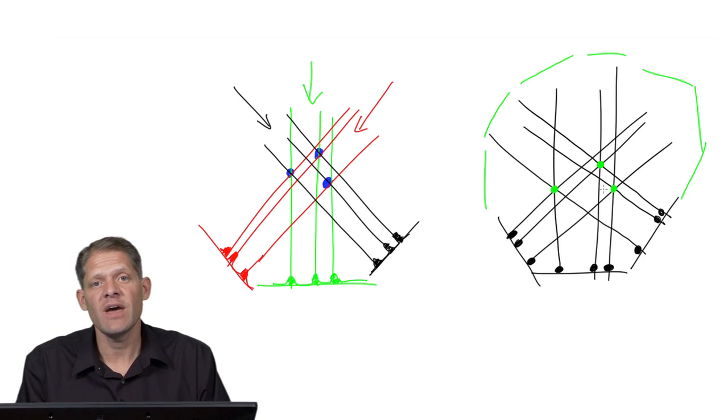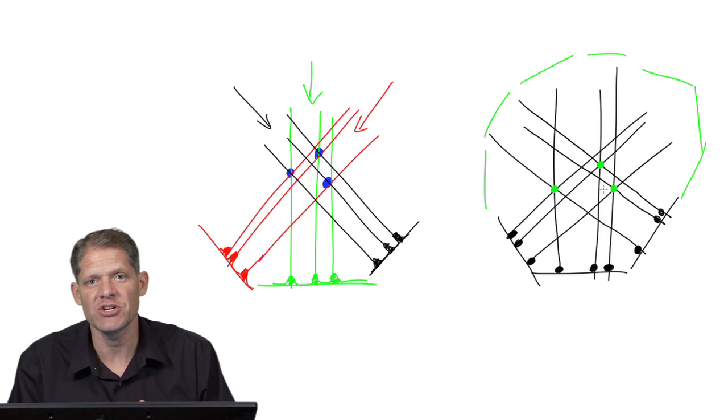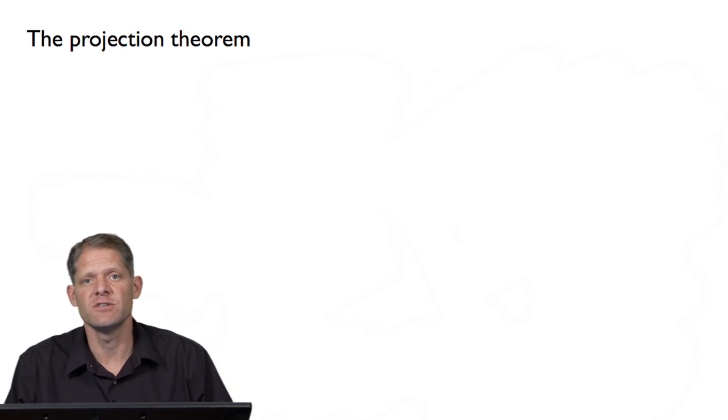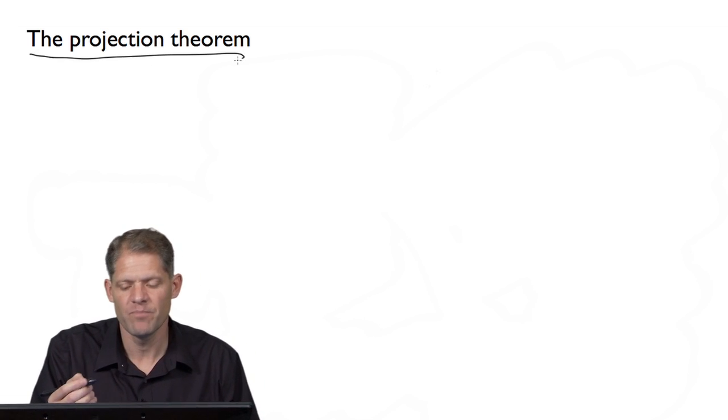So this is the basic idea of 3D reconstruction by back projection. Now, while that description of the back projection might be helpful conceptually, in practice, 3D reconstructions are usually calculated in reciprocal space. And in order to understand that, we need to talk about the projection theorem.